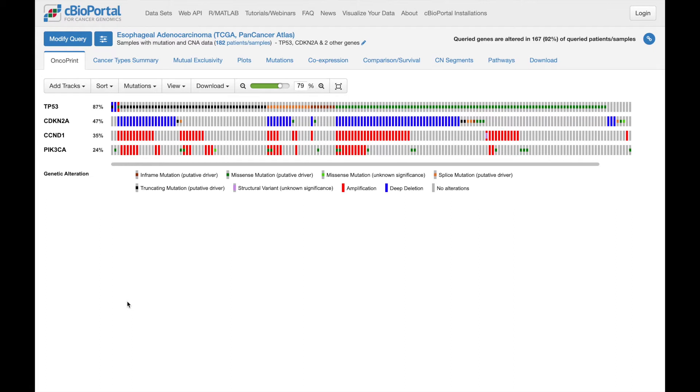We start on OncoPrint, which provides a nice compact summary of alterations in our query genes, each shown as a row here, across the whole cohort, so each column here is a patient or a sample.